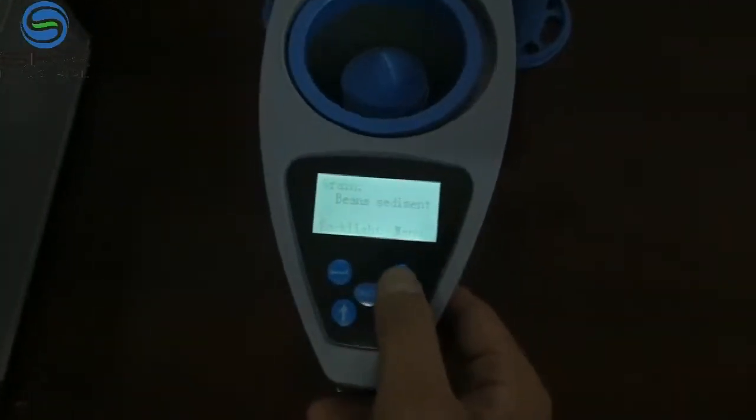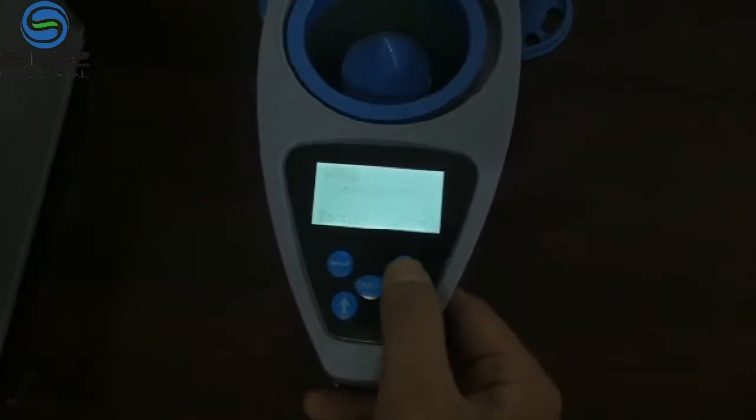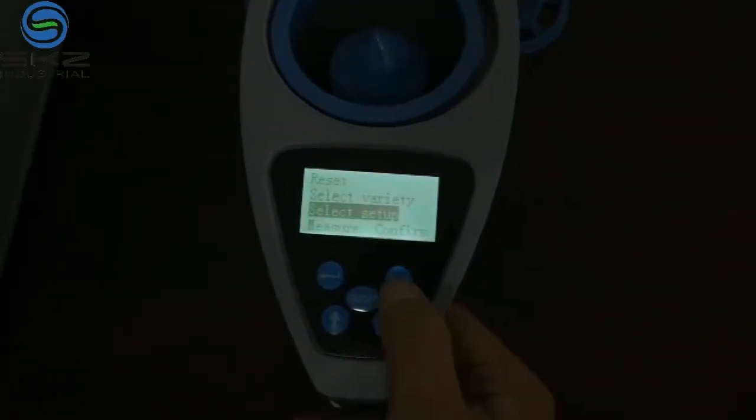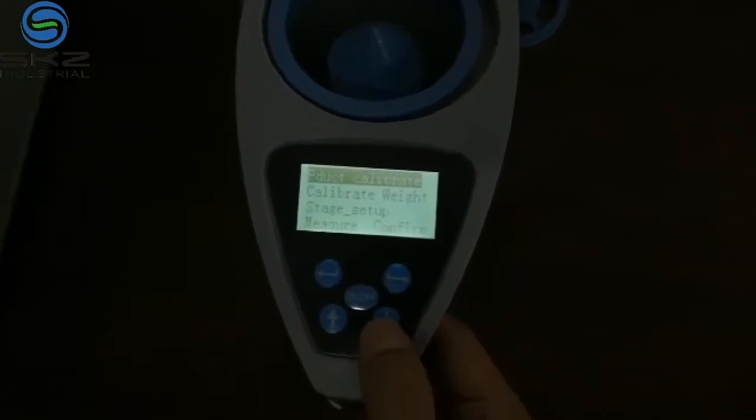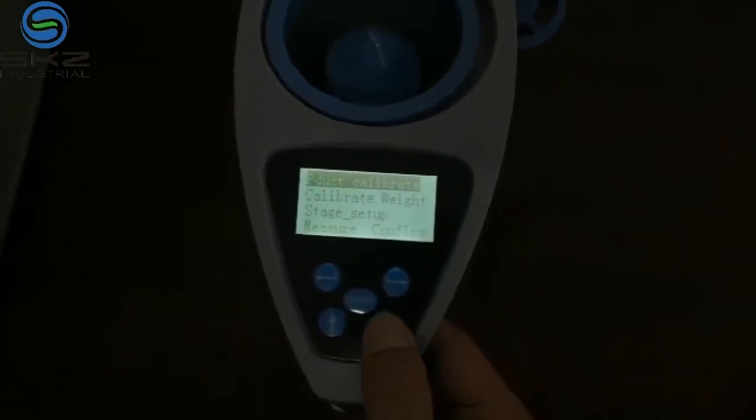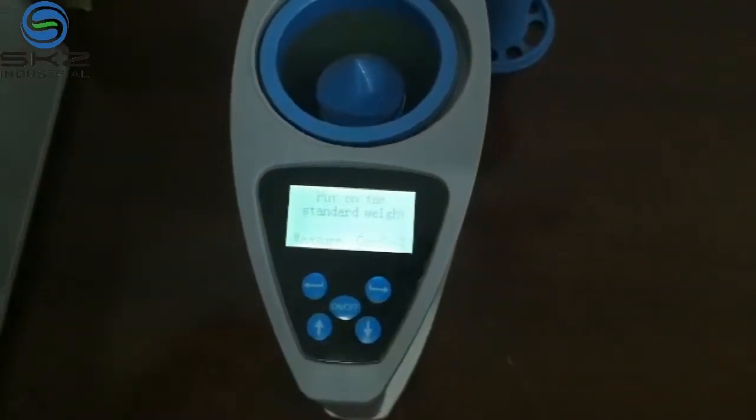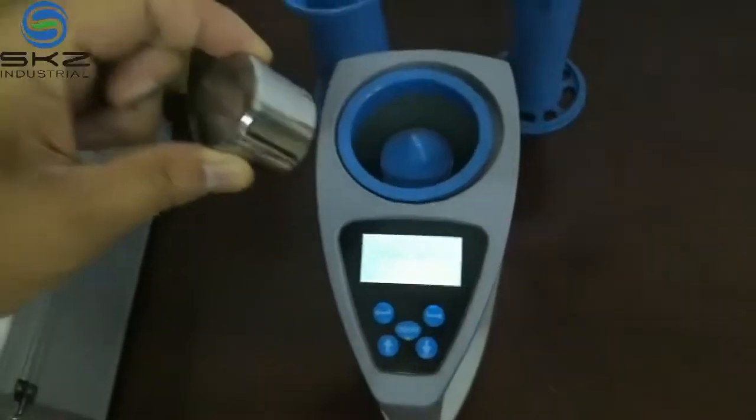First I press menu and select setup, and calibrate weight. Then press confirm. Then put the calibration weight. This is 200 grams.